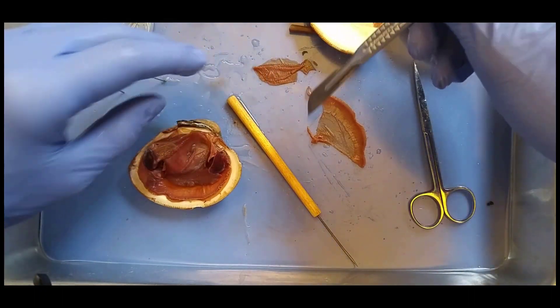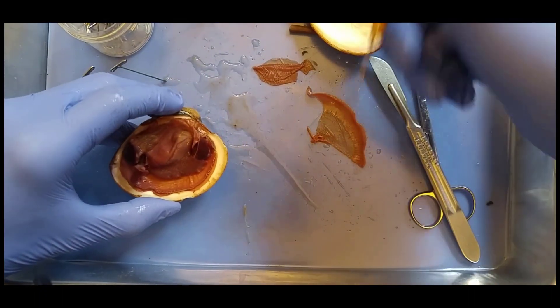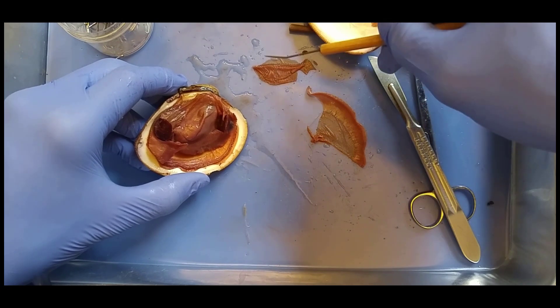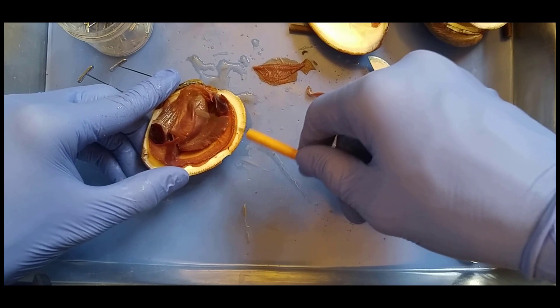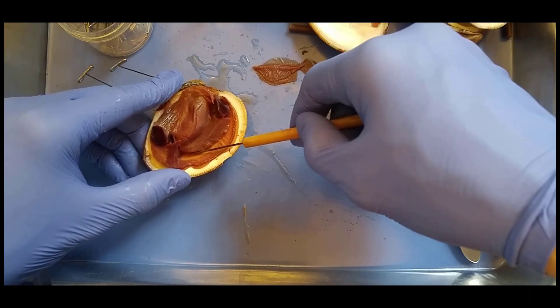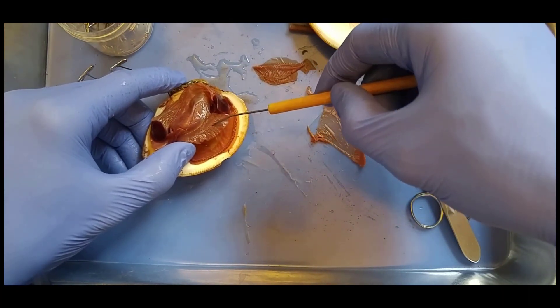So the gills facilitate gas exchange. They filter the water for nutrients. All right, so we got the shell, the mantle, the gills, and so here we see a big bulge right here. This is the visceral mass. This is where all their organs are. This is where all their guts are. And then here we have this kind of fin-shaped structure — this is their foot.